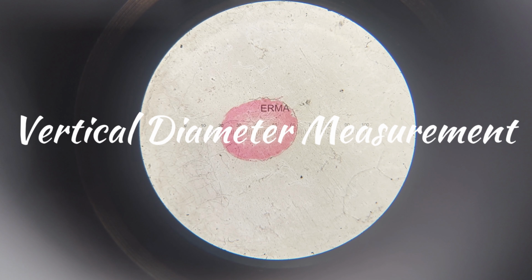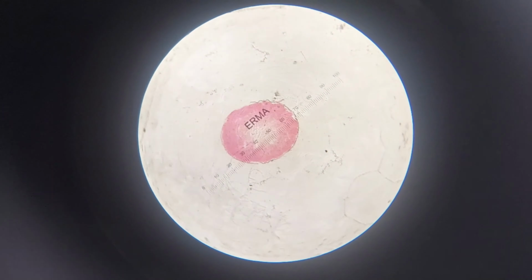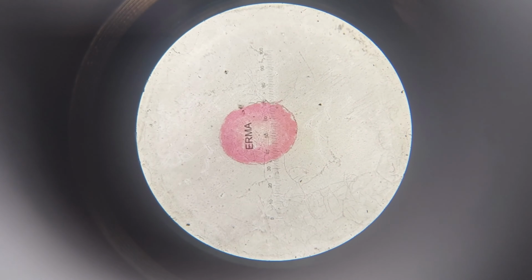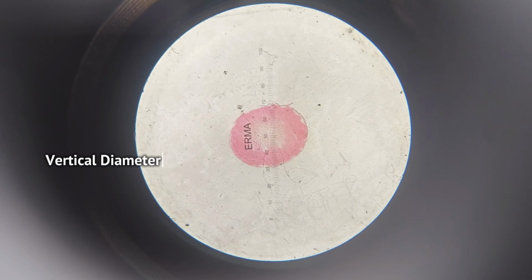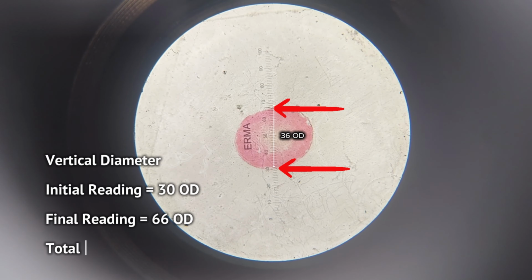For measuring the vertical diameter, the eyepiece and specimen are adjusted appropriately. The vertical diameter extends from 30 to 66 ocular divisions. Therefore, the vertical diameter occupies 36 ocular divisions.